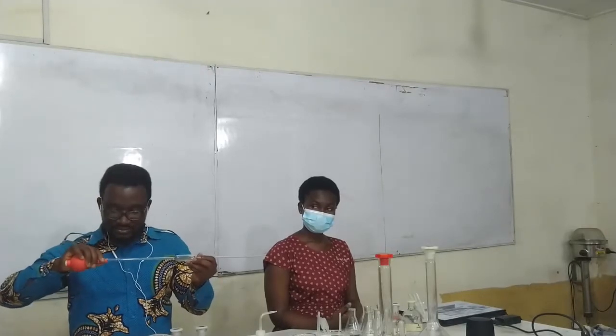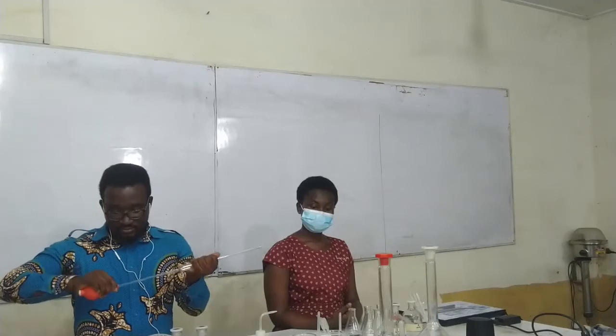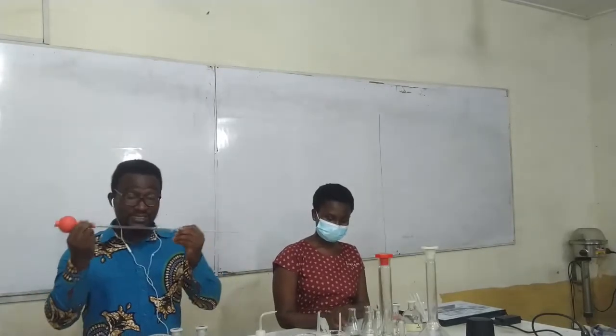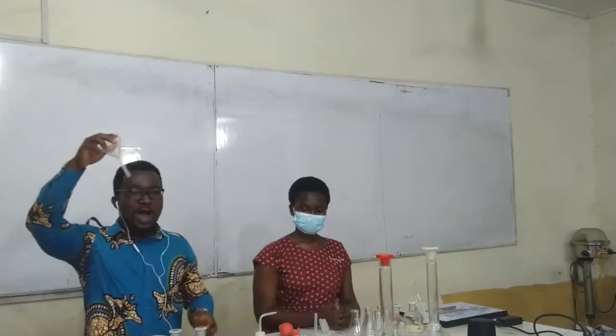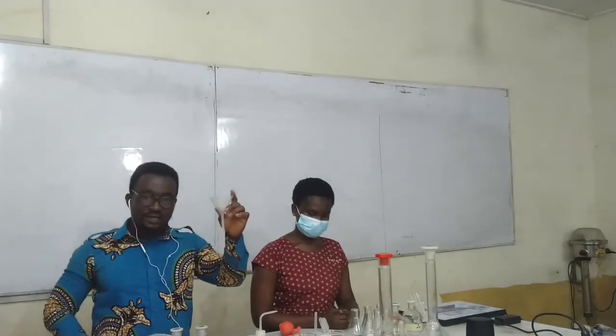Students used to suck and at the end of the day drink most of the solution. We don't want that to happen. Therefore, it was necessary for us to introduce the pipette filler. So our madam will be using the pipette filler, for you to see how it is used to pick the 25 cm3 of a particular solution. She'll perform that practice for you before we start with our main practical. We also have the funnel.